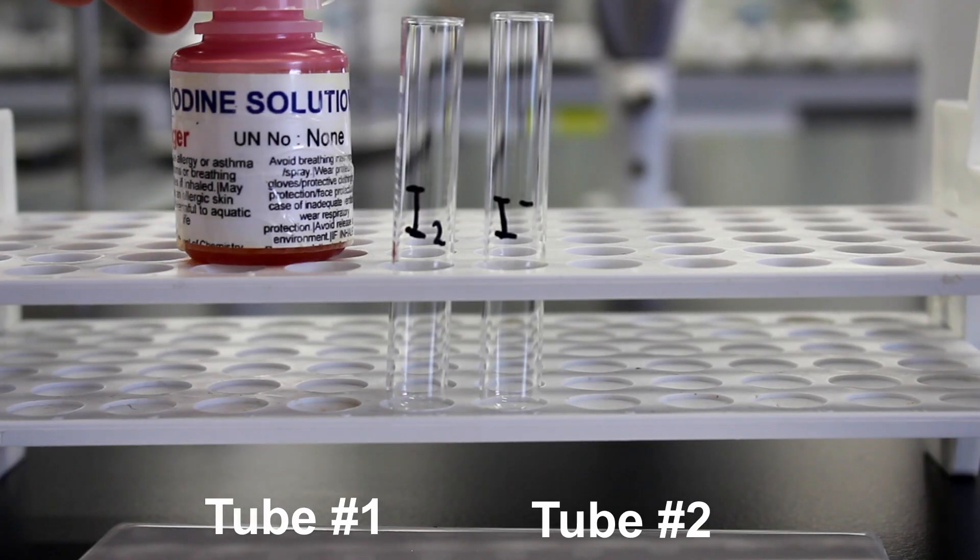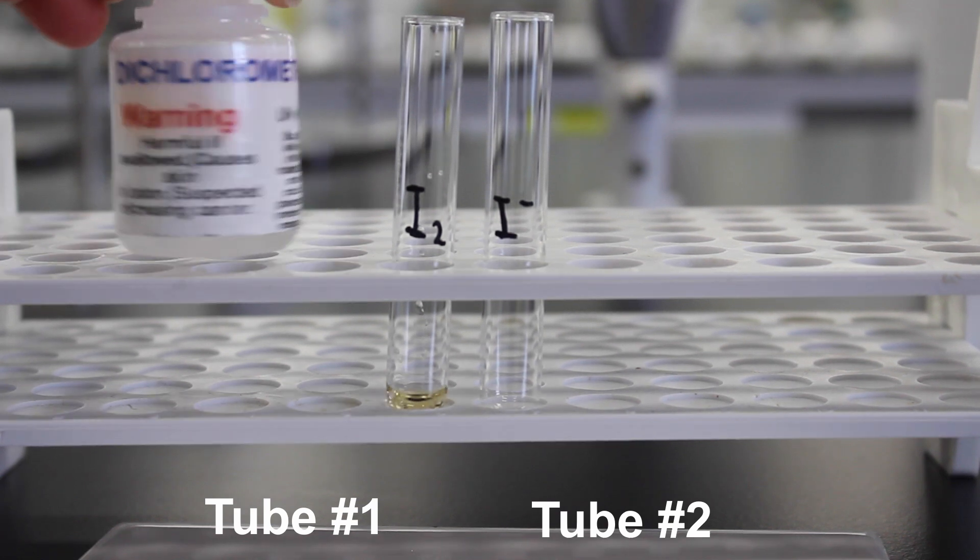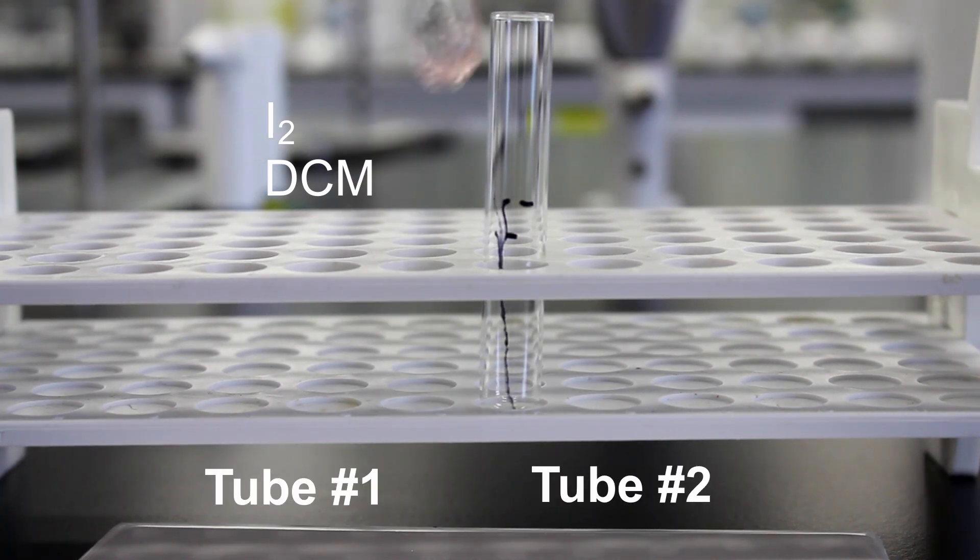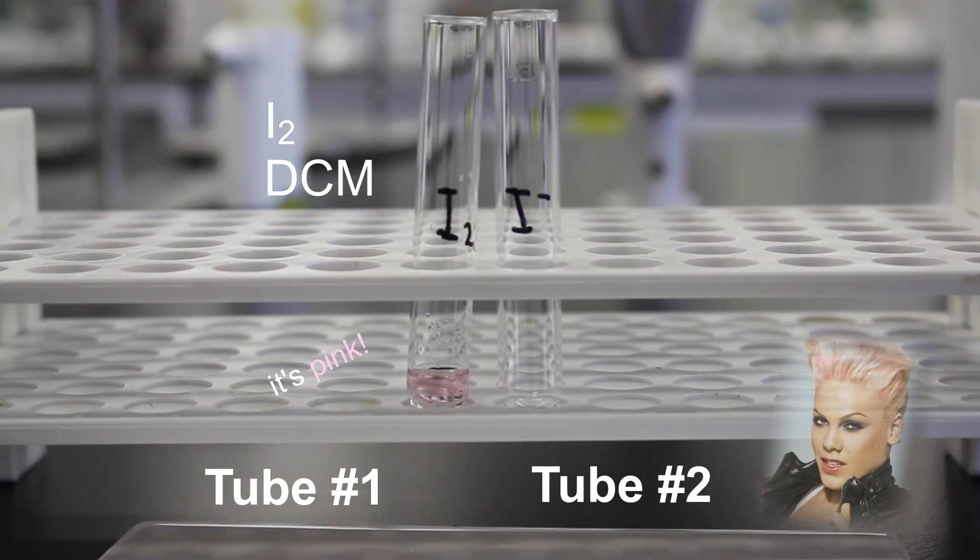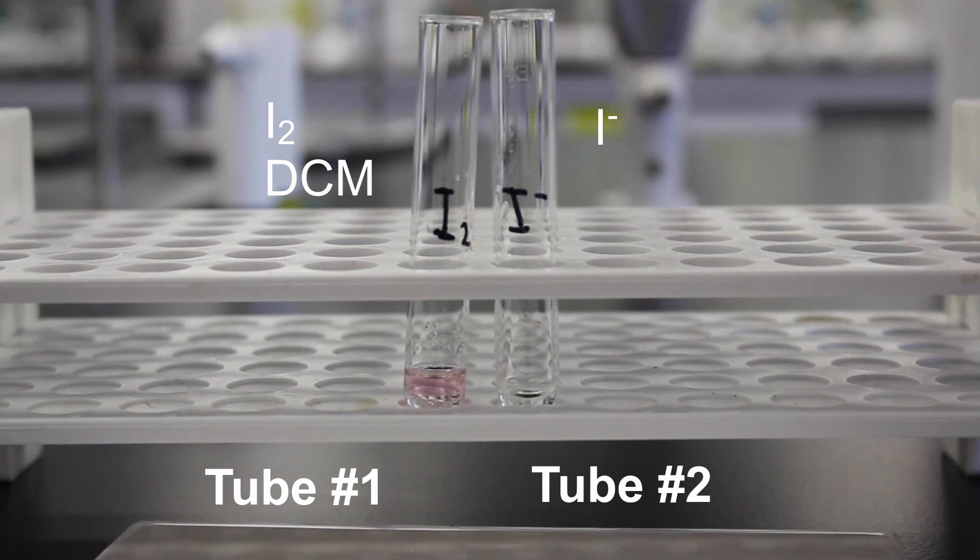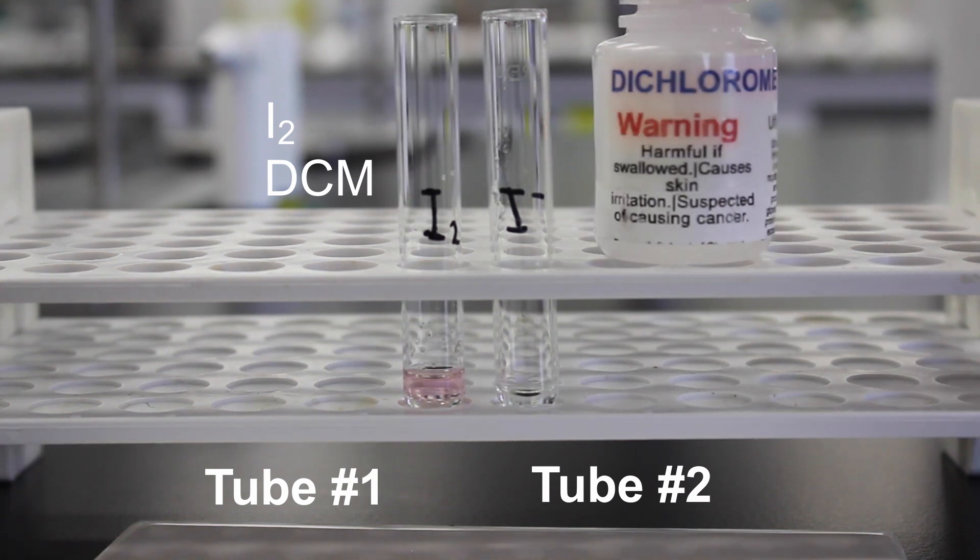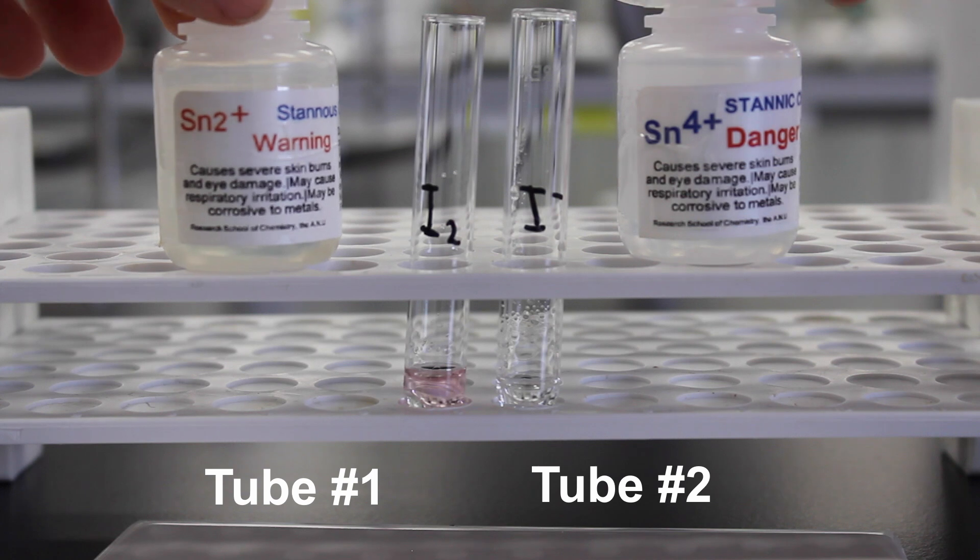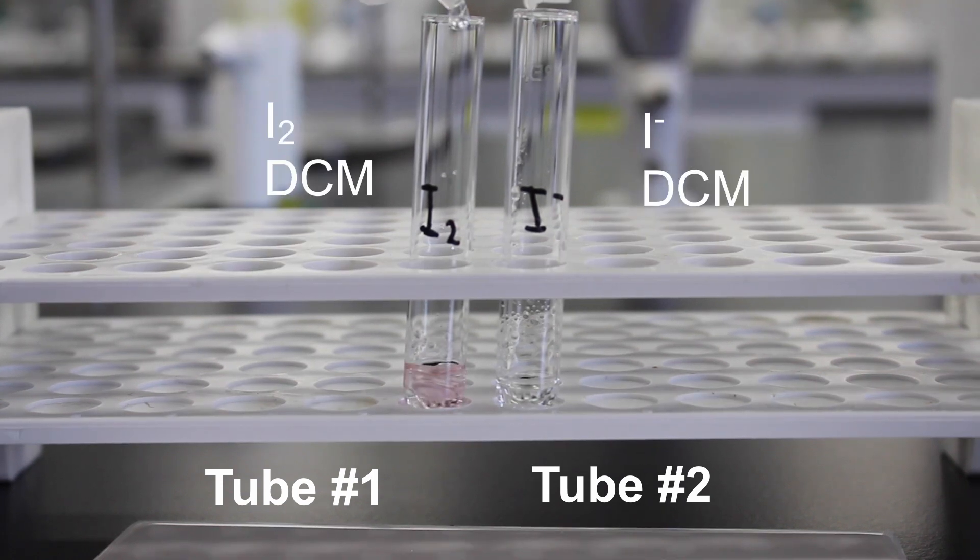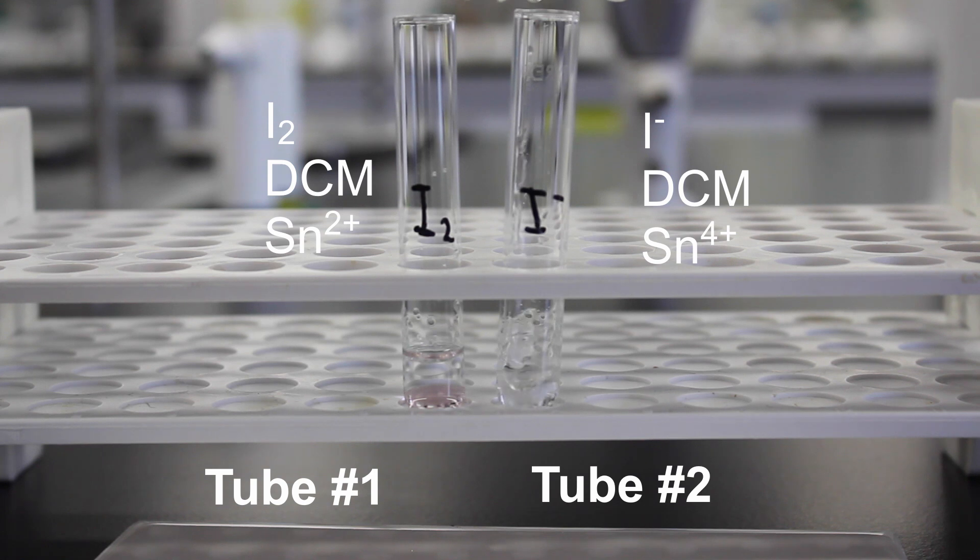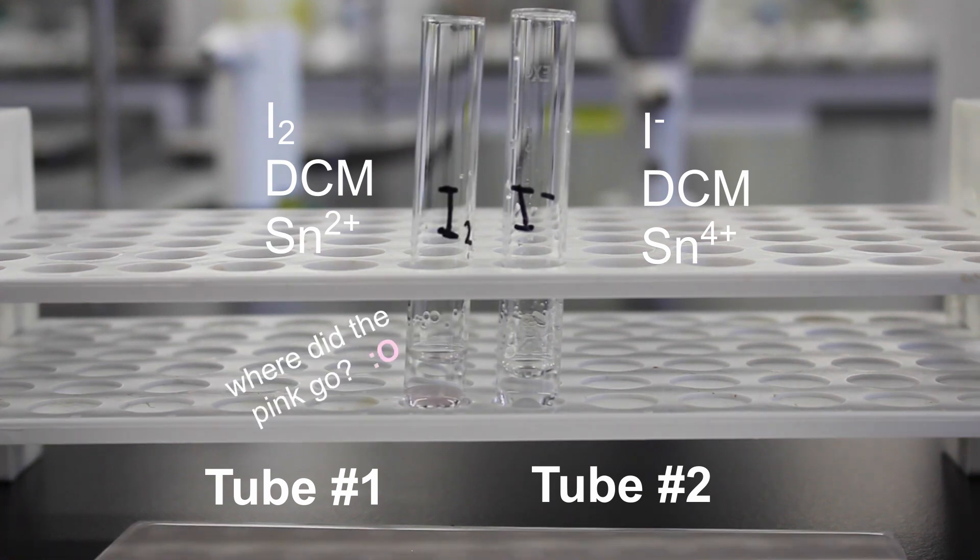To your first test tube, add a few drops of your I2 iodine solution. We'll again be using dichloromethane to compare these two experiments. To your second test tube, add your iodine ions and add some more DCM. We will now add the appropriate tin couples to each test tube. In the first test tube, add tin 2+. And in the second test tube, add your tin 4+. Remember that dichloromethane tests for the presence of I2, and have a think about what it might mean to see it disappearing.